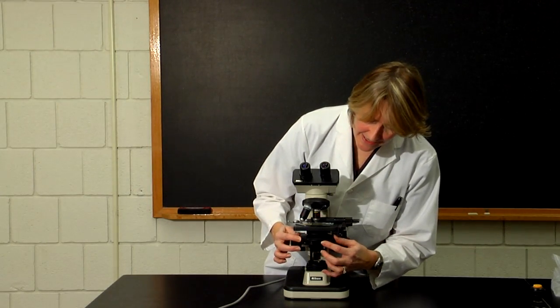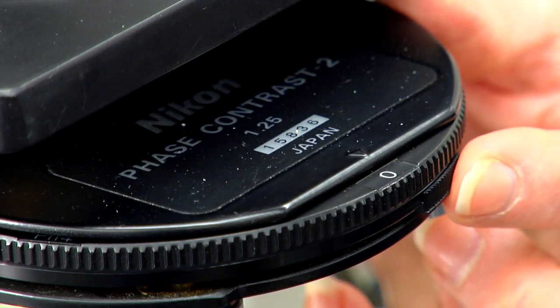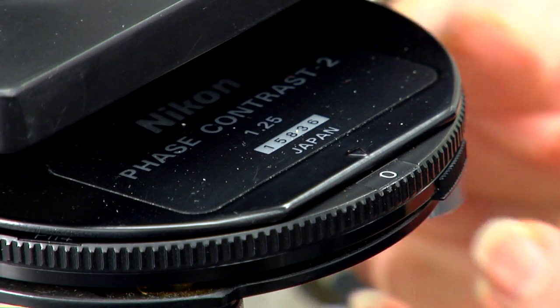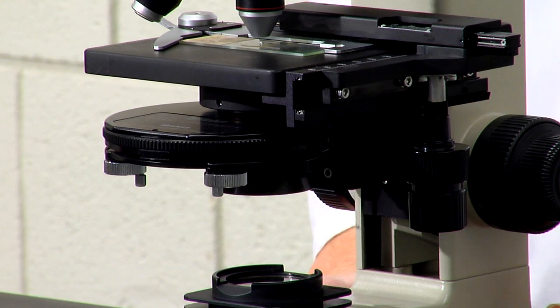For brightfield microscopy, you should place this at approximately partial open, half open. Allowing too much light to pass through the lens will make the sample appear washed out, and so when you view your sample, you may need to close the iris diaphragm further to get better contrast on your object.